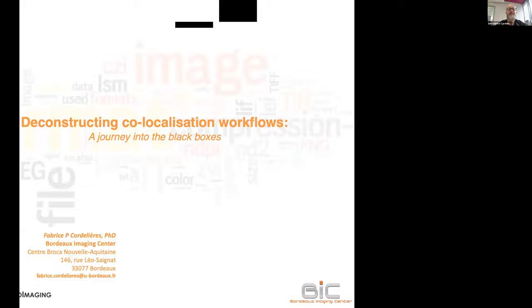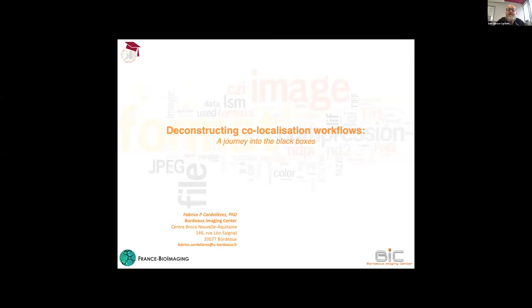Of course, there are a lot of methods depending on the topic you're working on, but my idea with this first introductory seminar is really to revisit the generic methods and to make you understand what is behind them, how to use them, how to combine them, and how to play and get significant numbers out of your images. So let's dive into this black box that is co-localization.